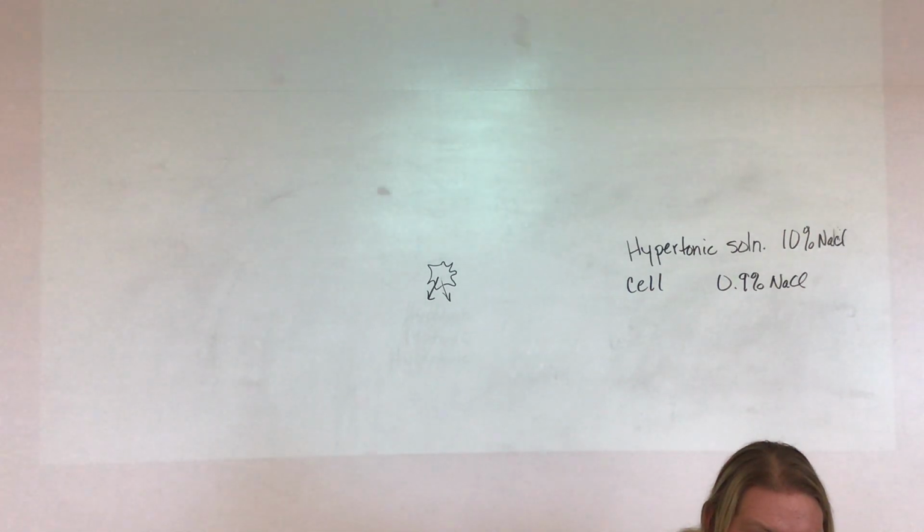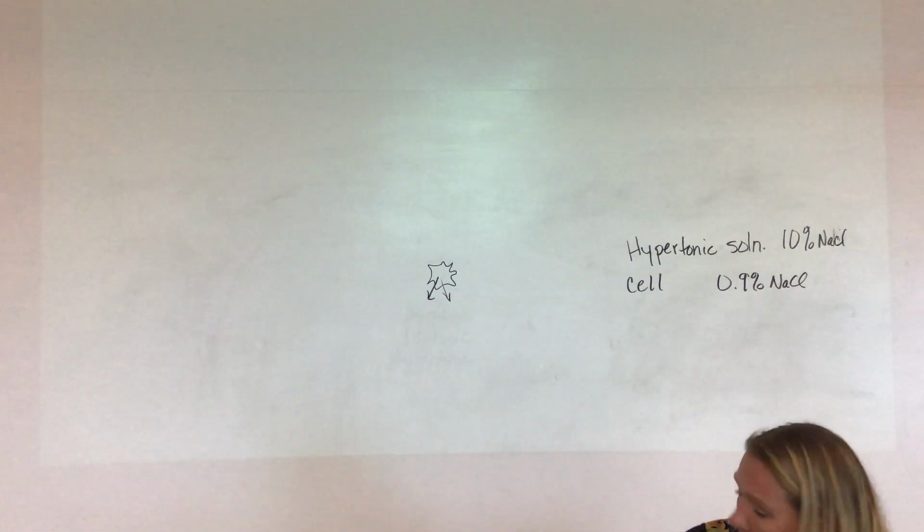And our slide's a little bit dirty. Go to high power. And try to focus. Alright, so I'm on it, but we're not really able to see anything.